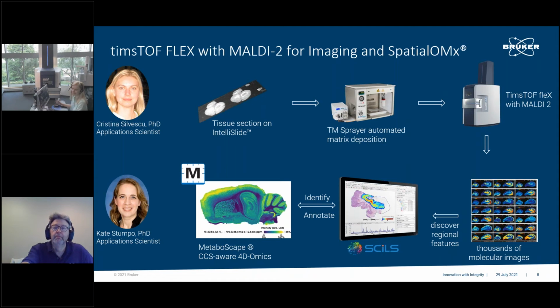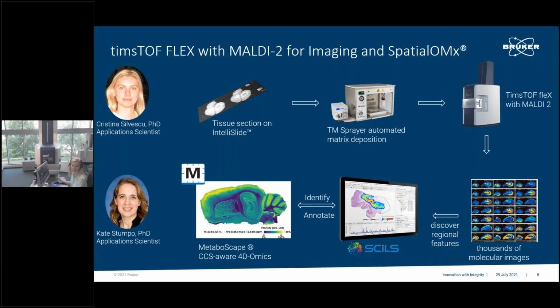Thank you, Shannon. Hello, everyone. Welcome to the Billerica Demo Lab. We are here right in front of the timsTOF fleX instrument equipped with the MALDI 2 technology, as you can see. And we'll be talking today about the mass spectrometry imaging workflow, how we acquire an image data set, and later on you will see my colleague Kate Stumpo showing you how to process the imaging data set.